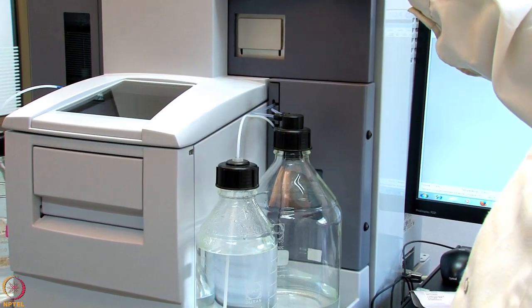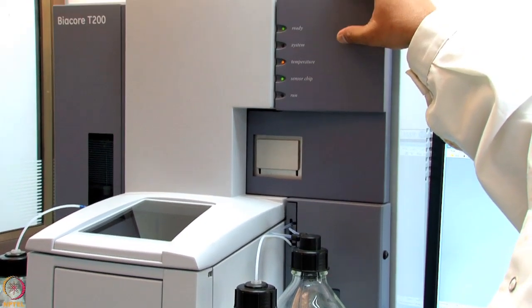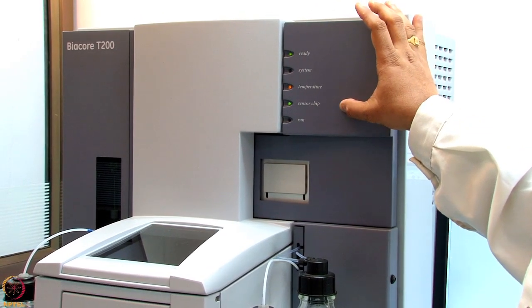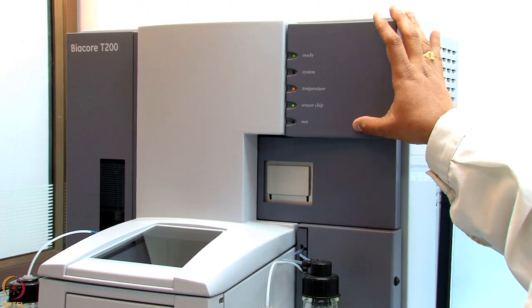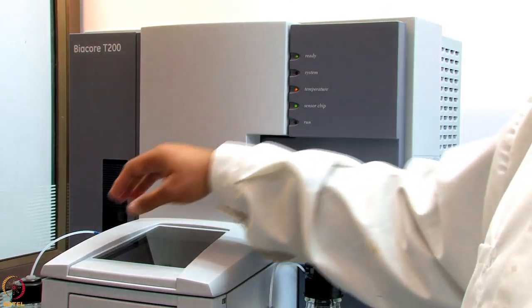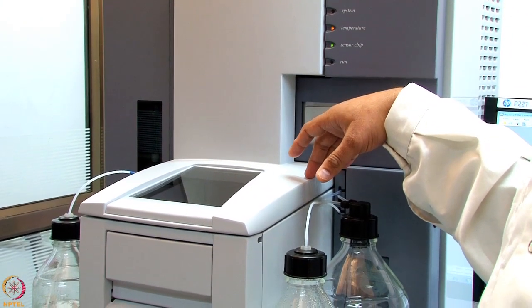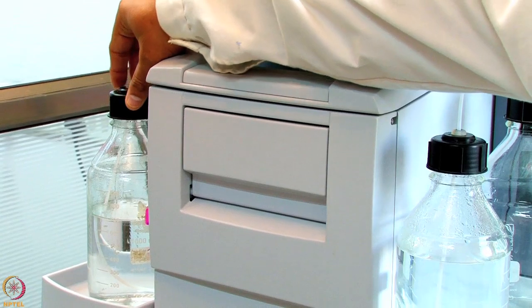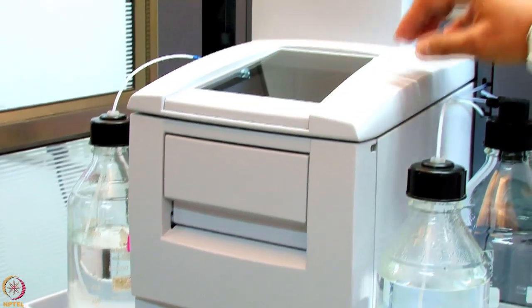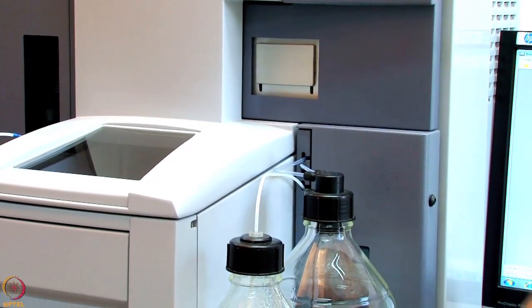Here some indications are provided when the machine is ready or the system is calibrating the temperature, when the new chip is docked and the run is actually happening. So we will now connect a new running buffer here and prime the system before our immobilization experiment. So here the new HBS-EP plus buffer is connected and the new chip will be docked now. So let us look at the chip now.